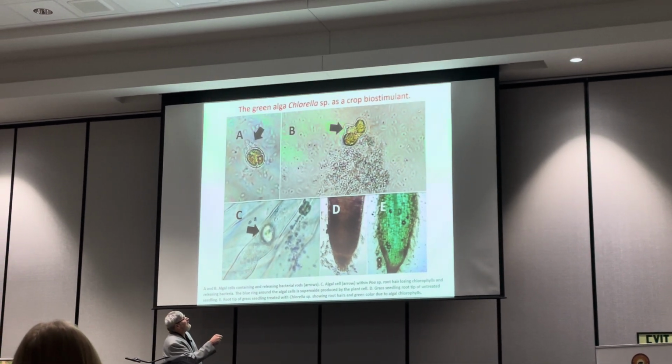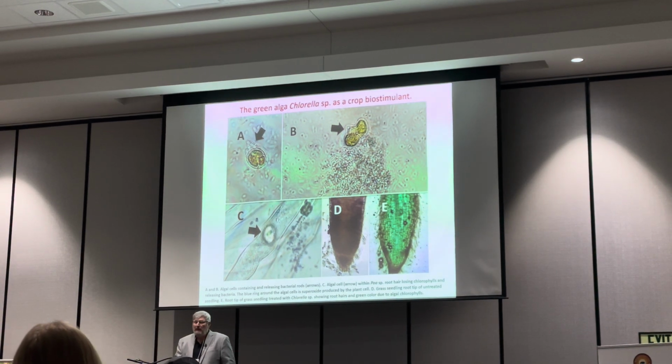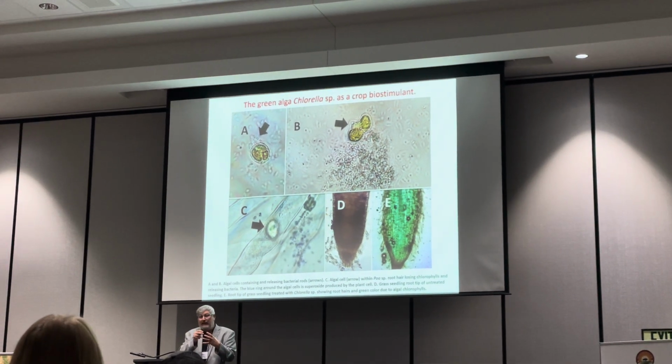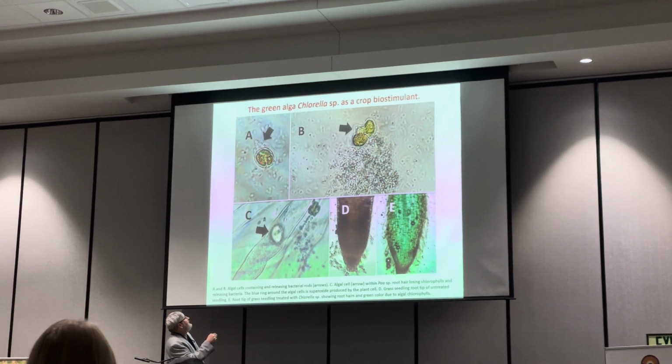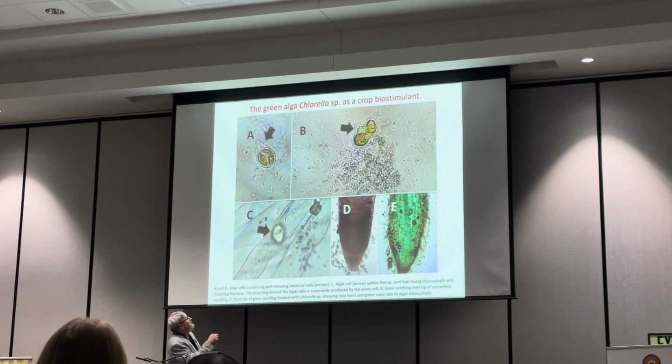In that algal cell, they actually have a little slime layer around them called a capsule, and the bacteria are underneath that capsule. They're probably also in the cells. You can see it there too, all the little red dots, those are bacteria on those cells.